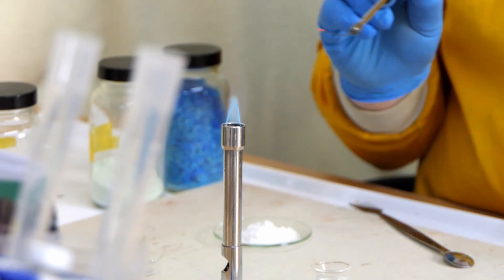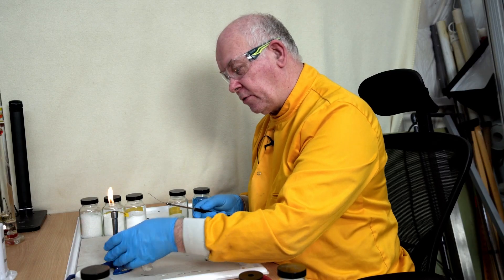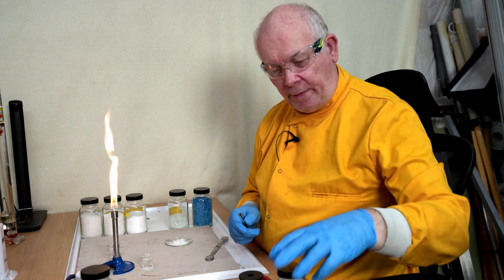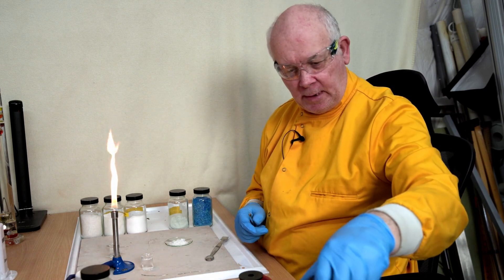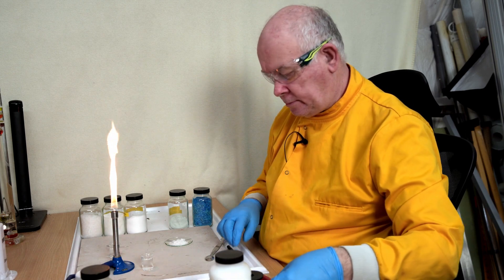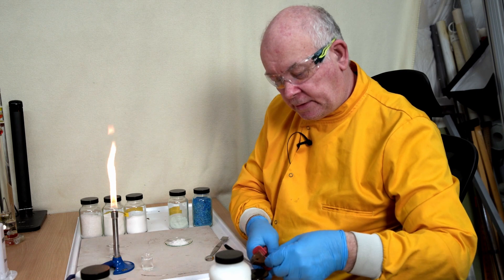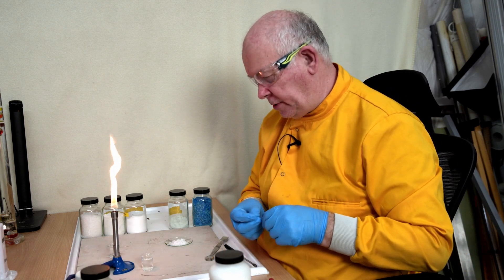Looking very, very similar - so I think it could be strontium. There are of course other metals that burn with other colours, so let's have a quick look at some of these. I don't believe it is potassium, but I'm going to check to be sure.